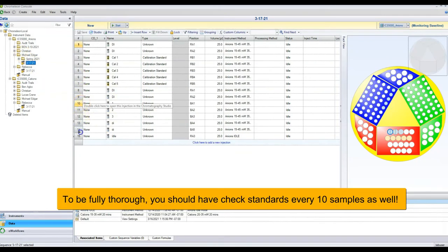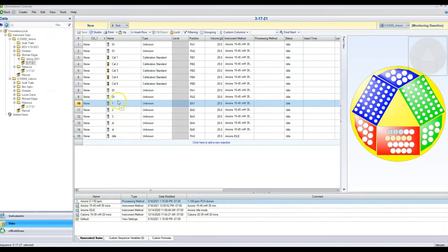You can copy and paste entire segments to speed things up. Once you have all your sample spaces in the right order, change the names — I'm just going to name mine one, two, and three. Then we need to tell the instrument where the samples are. For sample type: unknowns are measured as unknowns, and calibration standards are obviously calibration standards. All types run the same way except calibration standards, which are used to build the calibration curve for determining concentrations. I usually keep everything as unknowns except for the calibration standards.